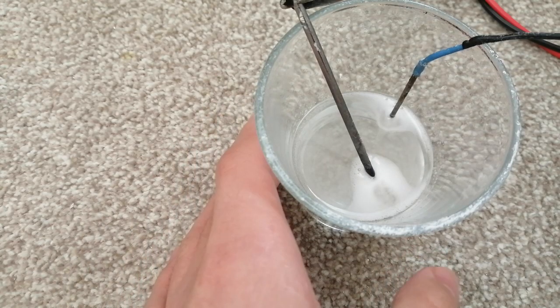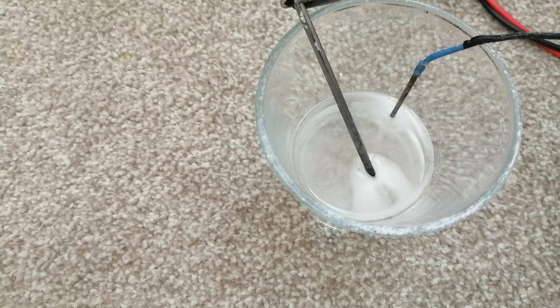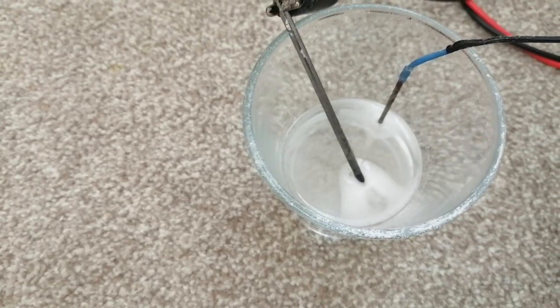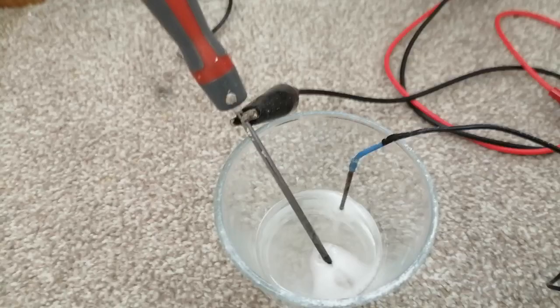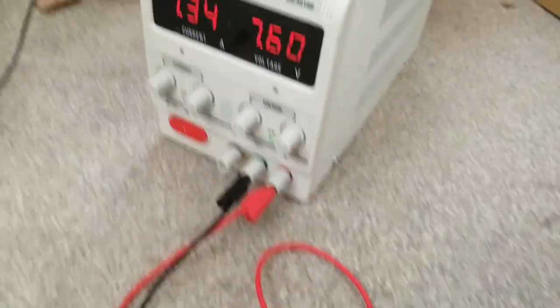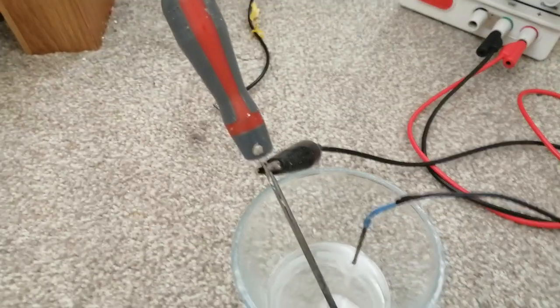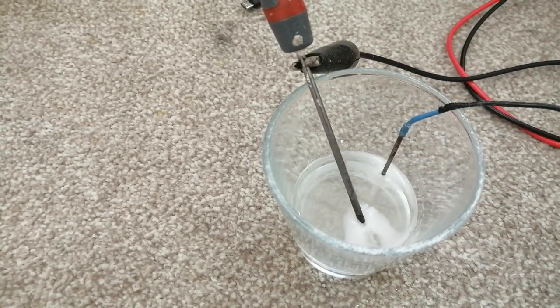In order to make the electrolyte, you'll have to dissolve as much sodium carbonate into your water as possible. Here I'm using electrodes, which can be normal stainless steel or normal steel. You can see the current on my meter. You want this to run long enough, but with low voltage and high current.